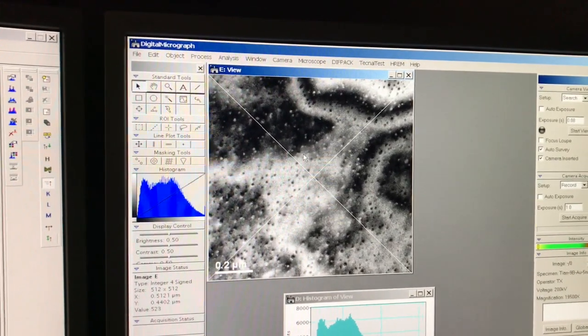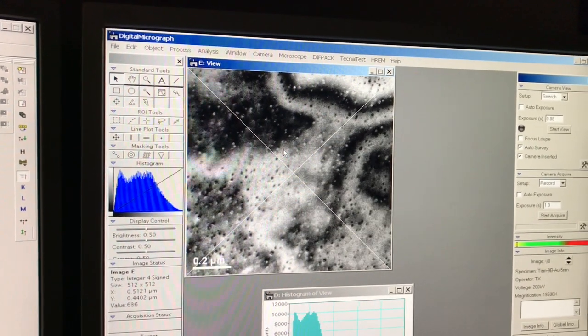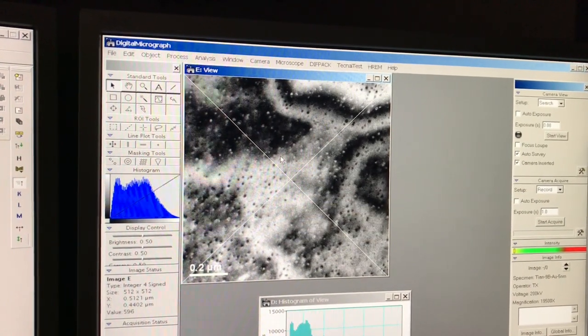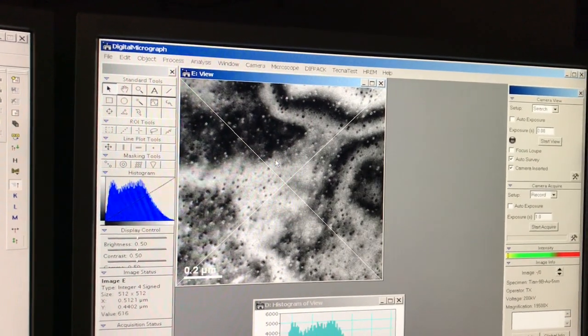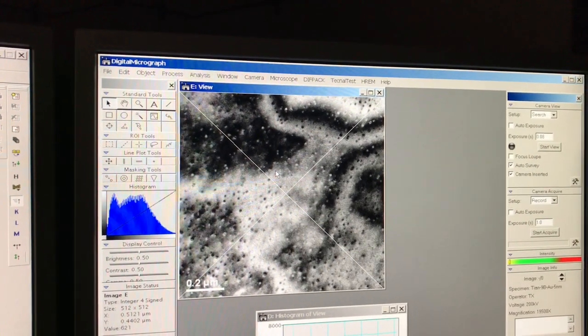So one thing you'll notice here, again, I have a deviation parameter of 0. Okay, my faults are not very distinct when I do this, because I have a large contribution from the regions of the specimen that are non-defective. Okay, so we're going to talk in a minute about how to alter the two-beam condition to change that.